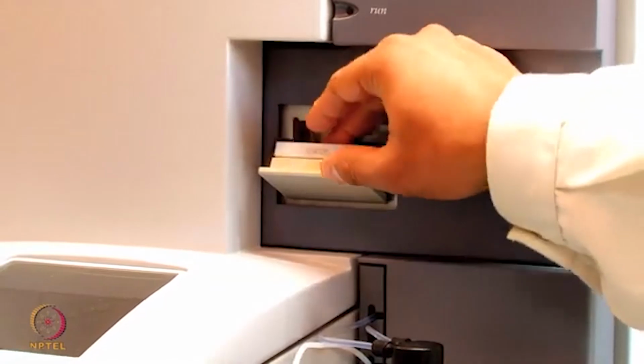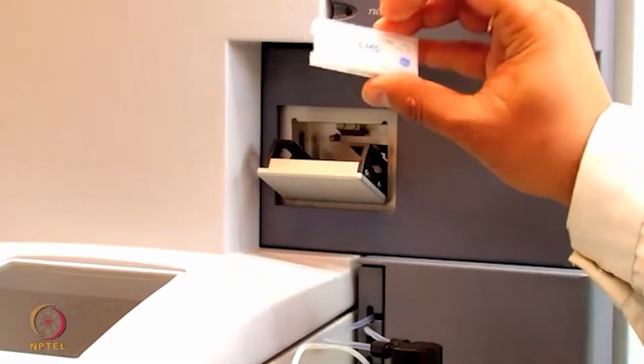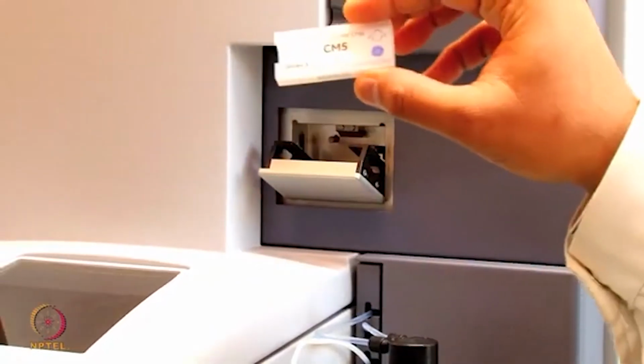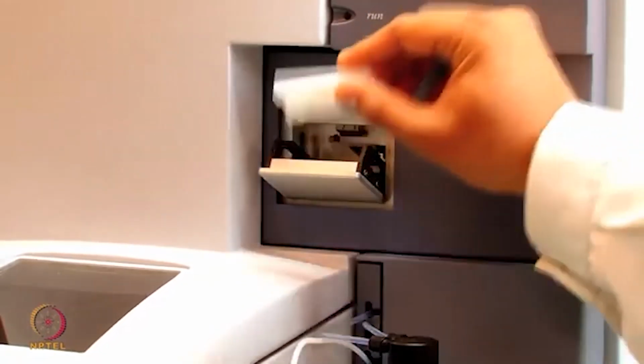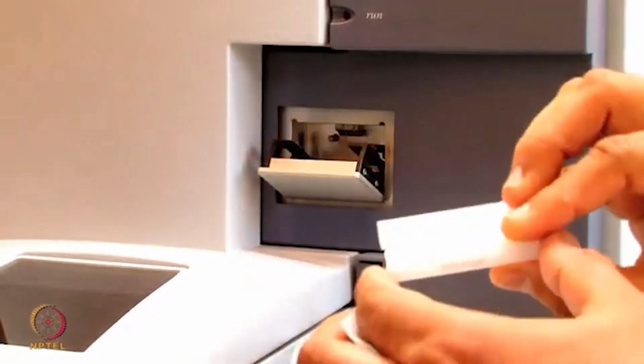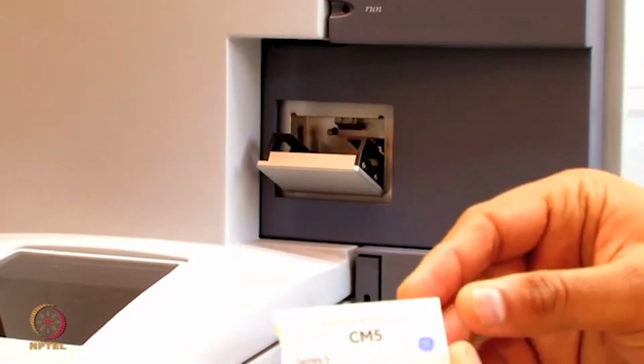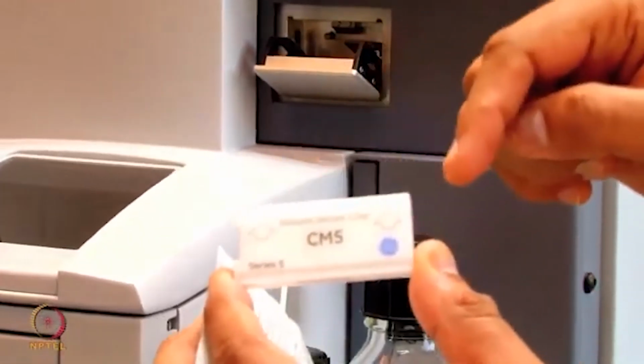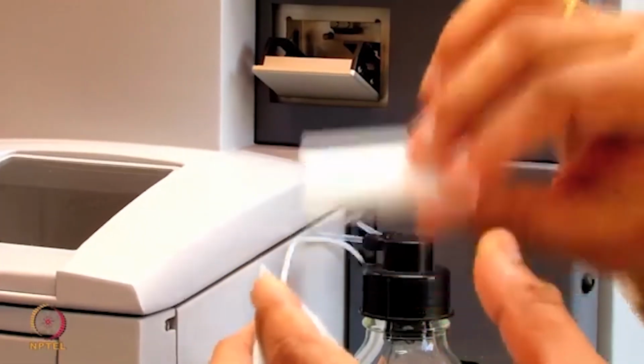So now the old chip will be removed and we will insert a new Biacore chip CM5 here, and the orientation of the chip for insertion is shown on the chip in arrows.